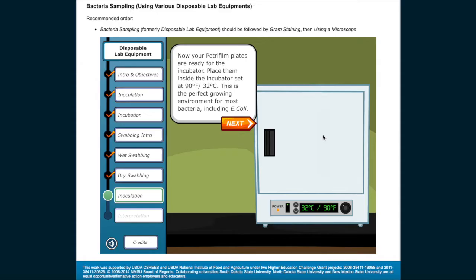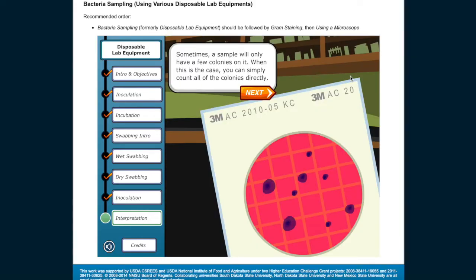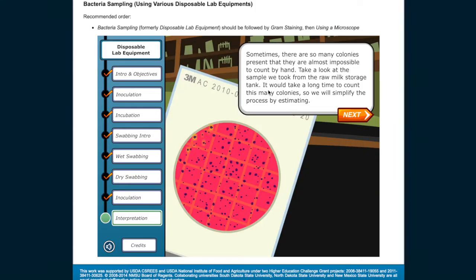This is the perfect growing environment for most bacteria, including E. coli. Now wait 48 hours to let the cultures grow. Sometimes a sample will only have a few colonies — you can simply count all of the colonies directly. Sometimes there are so many colonies present that they're almost impossible to count by hand. Take a look at the sample from the raw milk storage tank — it would take a long time to count this many colonies, so we will simplify the process by estimating.